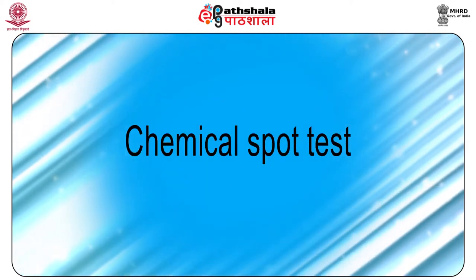Let us discuss chemical spot tests in detail. Prior to advanced techniques, the inks were chemically analyzed and differentiated by chemical spot tests performed on the ink itself or on small fragments of ink strokes punched out from the ink line with the help of scalpel, hypodermic needle or punching plate, etc. And now these chemical spot tests are replaced by thin layer chromatography and other sophisticated techniques. However, in some cases, the spot test may prove useful for conducting preliminary examination. Numerous reagents have been suggested by different workers for performing spot tests. The following reagents may serve the purpose.